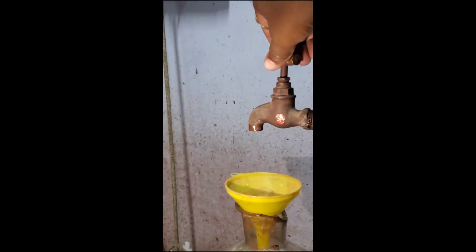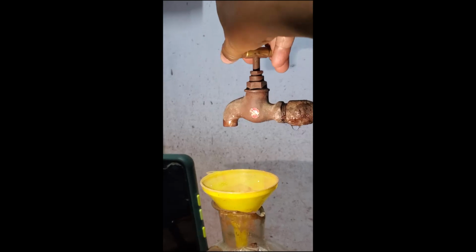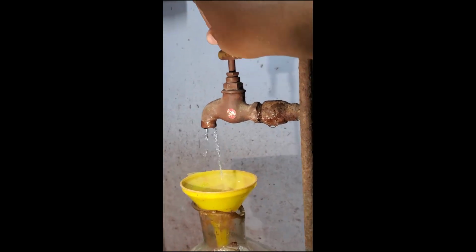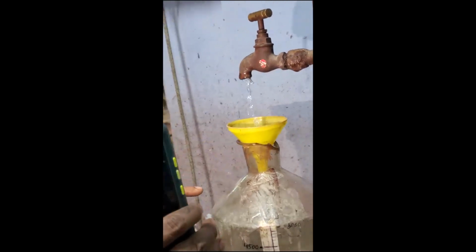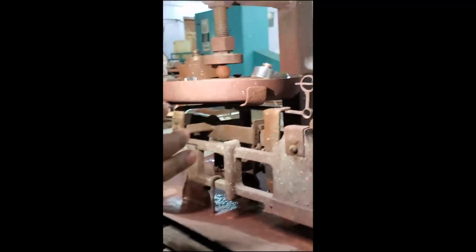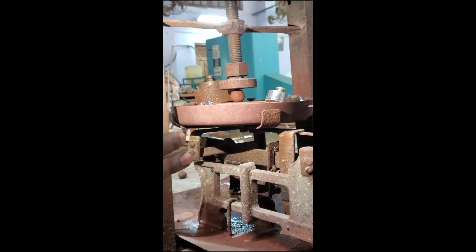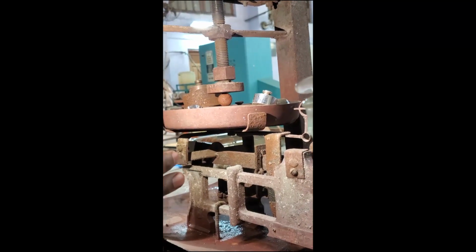Now we are filling the water and observe we are applying gradually the pressure on the pellet. So slowly the water is filling into this bottle. Force is applying on the pellet. Just to see how much water it will take to break this pellet.